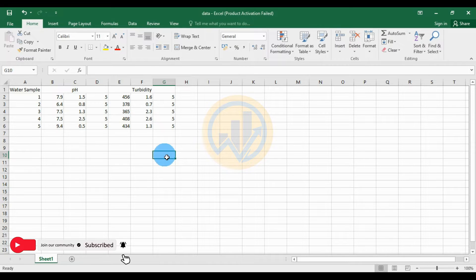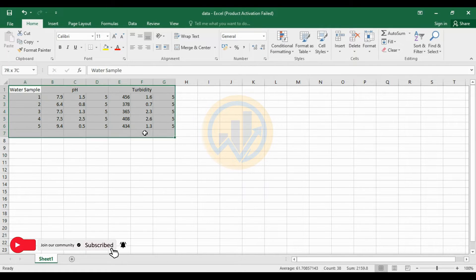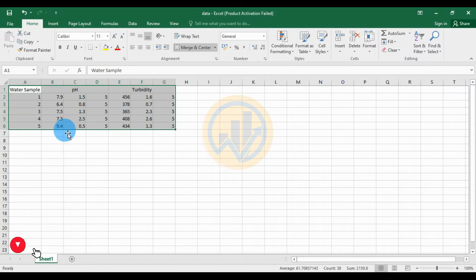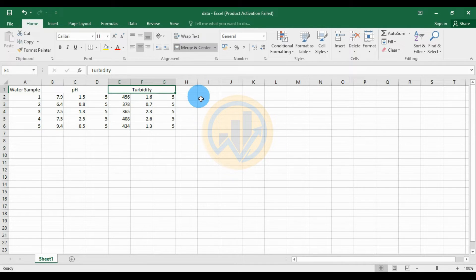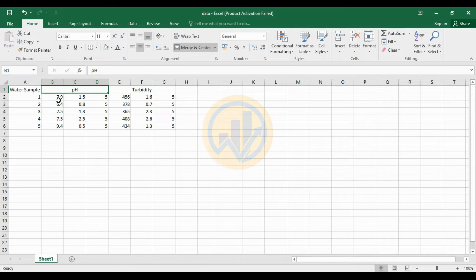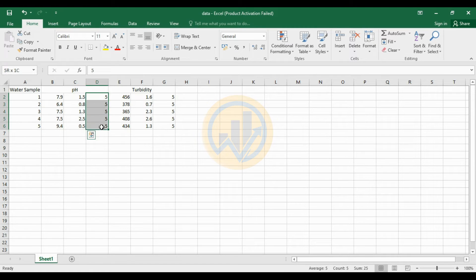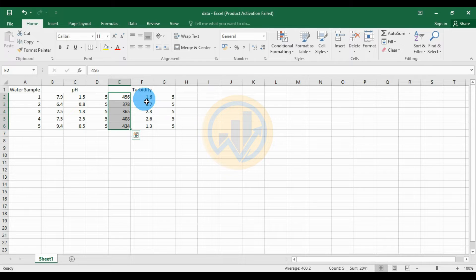This is the dataset for the double Y-axis bar graph in GraphPad Prism software. We have six water samples and two variables: one variable for pH and the next one for turbidity. The mean value, standard deviations, and number of replications — five times — are provided for both pH and turbidity. This is the mean value for turbidity, the standard deviation value, and five replications.